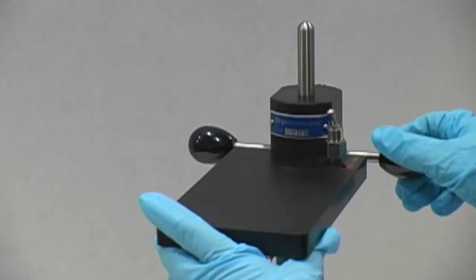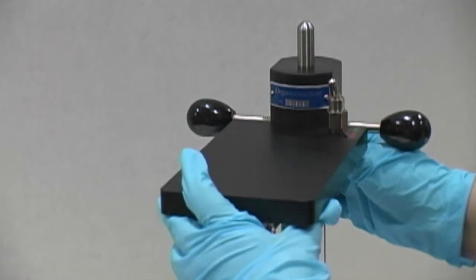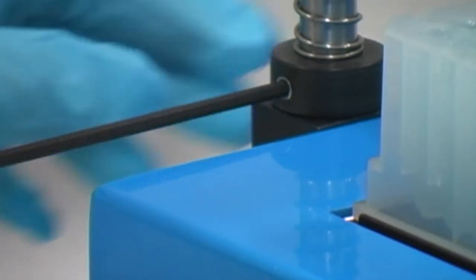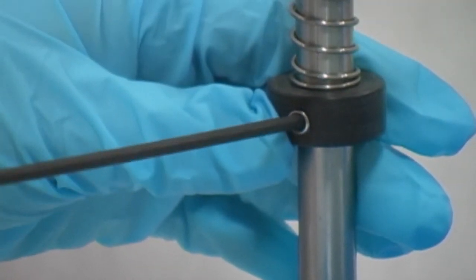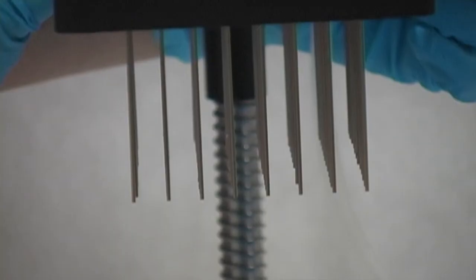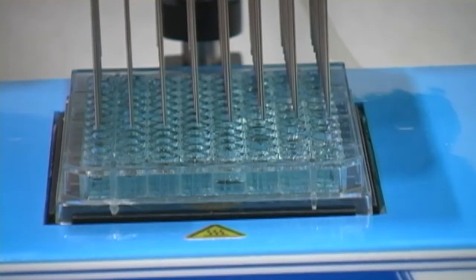Loosen the manifold thumb knobs to adjust the instrument manifold along the rod. Loosen the offset collar thumb knob to adjust the stopping height of the instrument manifold along the rod. Vertically position the manifold 6mm away from the plate.